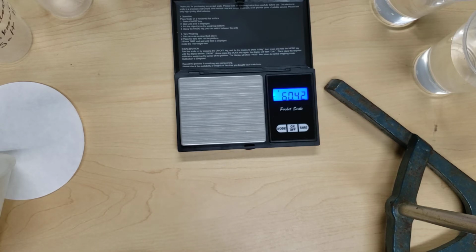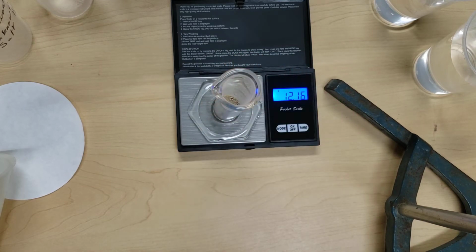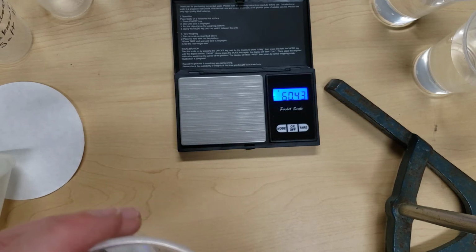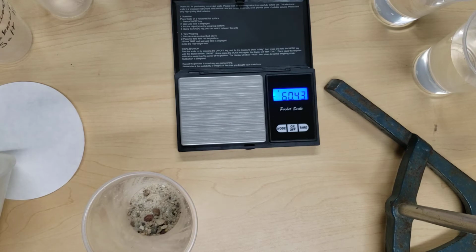The exact amount again isn't essential, but we are going to record the weight of the sand that we're adding into our unknown. By mixing these two substances, I'm going to mix them together. This is going to be the unknown that we're measuring in our sample. So that concludes making our unknown. We want it mixed, the salt and the sand.